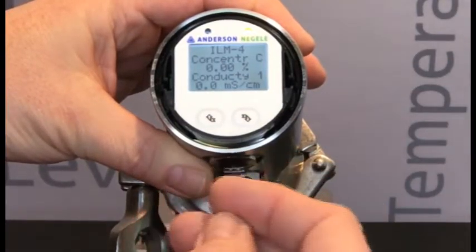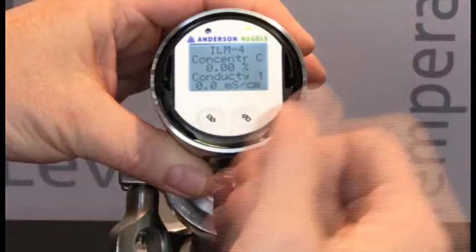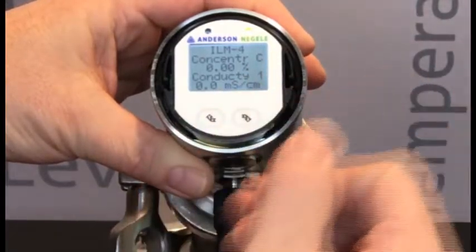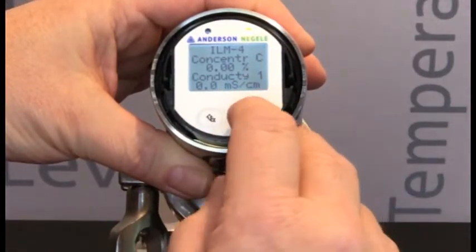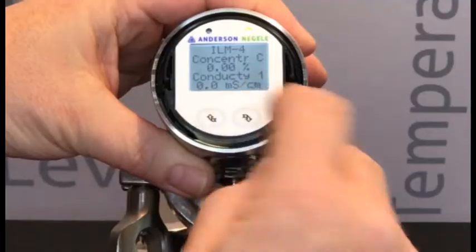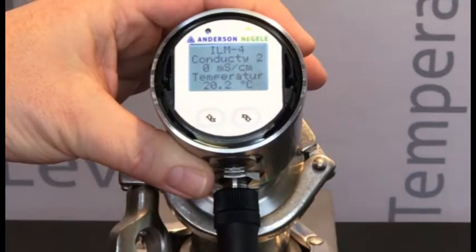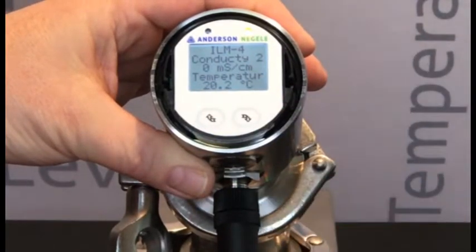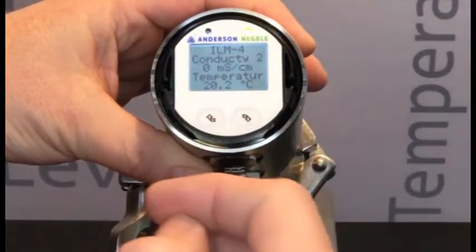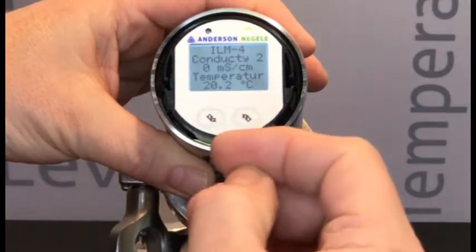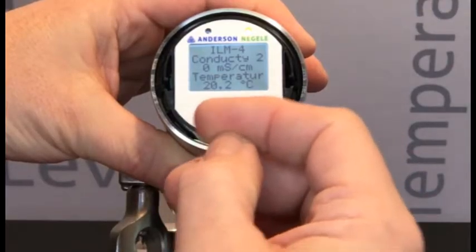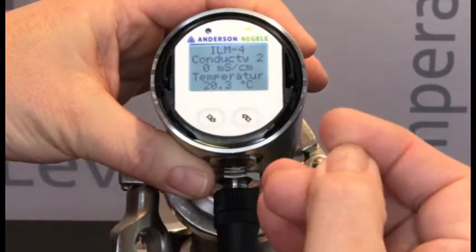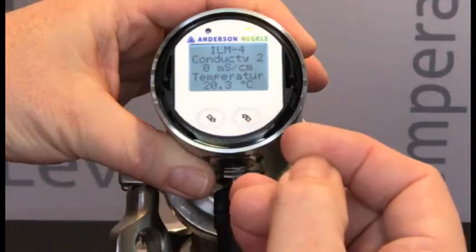A second short press will give me a concentration calculation. So if we had entered in values for a concentration curve, we would now be seeing that concentration percentage on the display. A third push takes us to a second conductivity measurement, which may be assigned to the second analog output of this device if it was configured to have one.